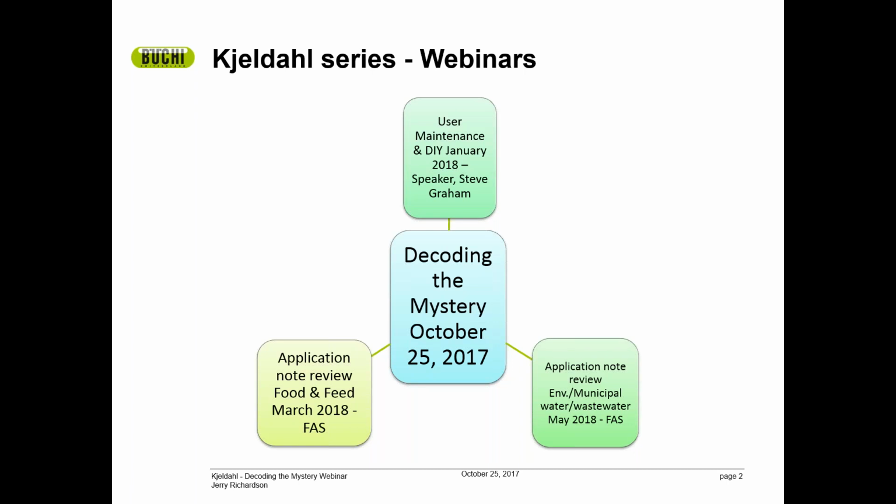And then the next webinar coming up in January is going to be about user maintenance and do it yourself. There's a certain part of the manual, usually chapter 6 or chapter 7 within the operation manual, where you can find all the maintenance information that you need for users to be able to tend to their instruments to keep them running at peak performance in between PMs. And then we also have a do-it-yourself kit for those who want to take that on and tend to their systems at a little bit of a deeper level.